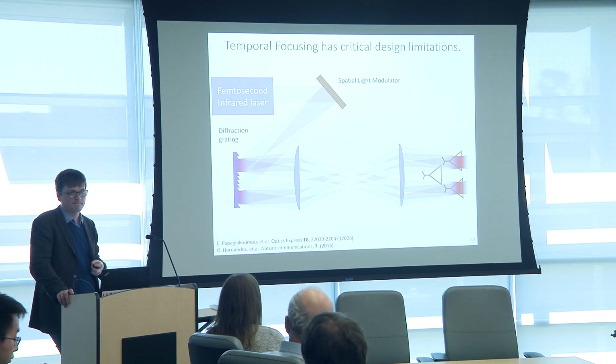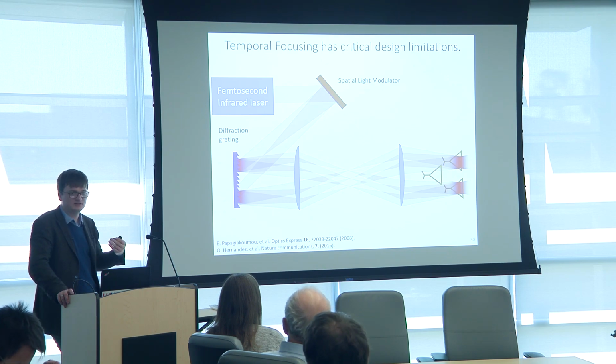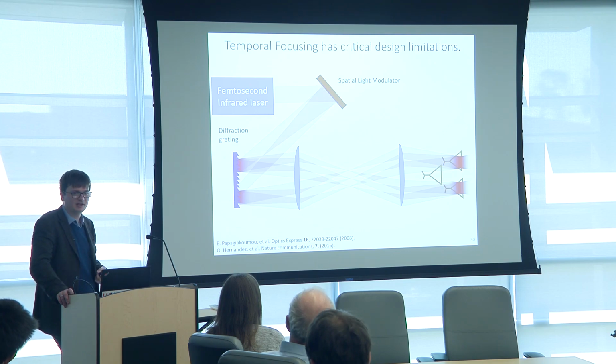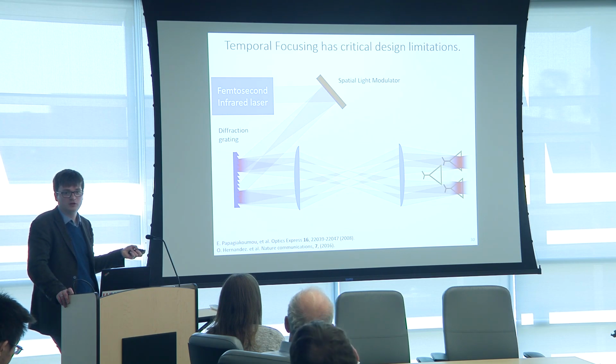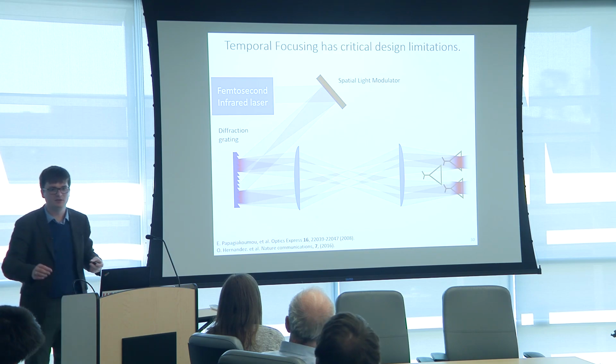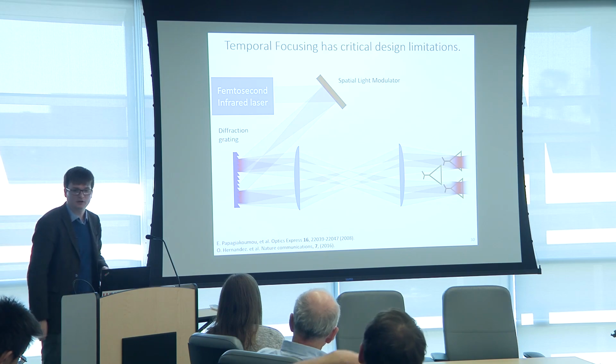But with only one, that wouldn't be possible. You would have to have, I would say, a deformable diffraction grating, and that technology is not really there yet. Gotcha. More importantly, you would only be able to focus one spot at a certain depth per XY location. So you would not be able to target 2 neurons on top of each other, for instance. Other questions?